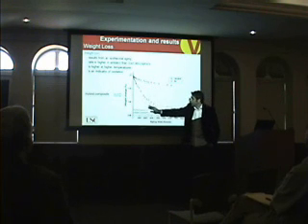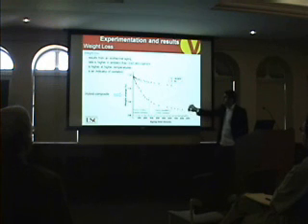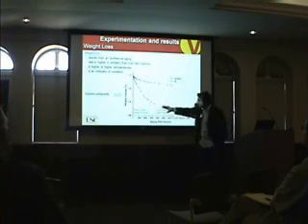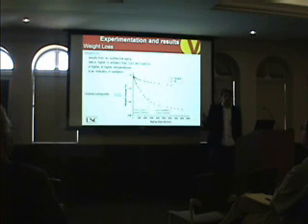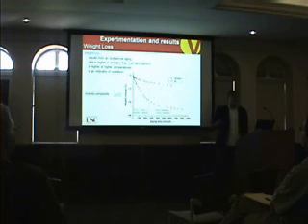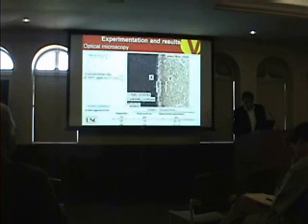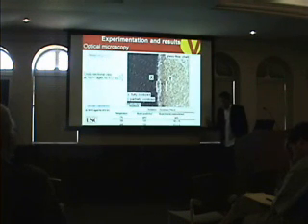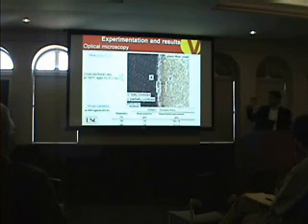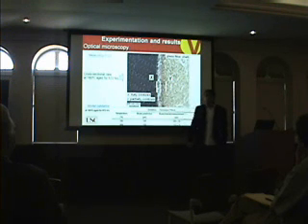So at a certain point, you see that the slope of the weight loss is going to be parallel to the slope of your vacuum oven, which means that at this point, the oxidation stops. So, some sort of stopping, and after that, thermal degradation is the primary mechanism for our material. After that, we take the sample out of the oven, we polish it, and by using optical microscopy, we measure the thickness of the oxidized layer.